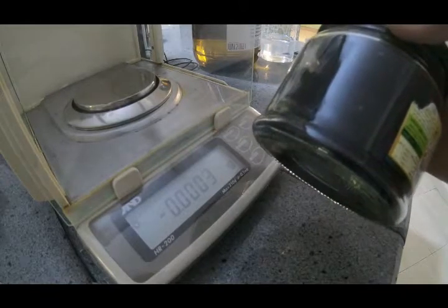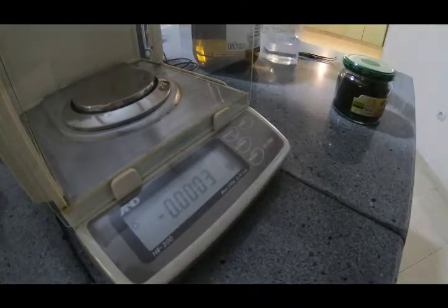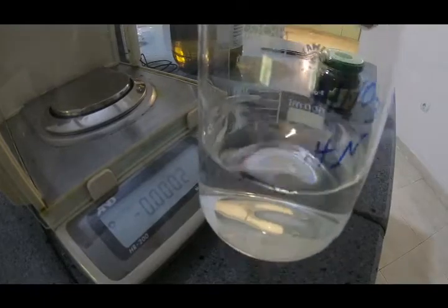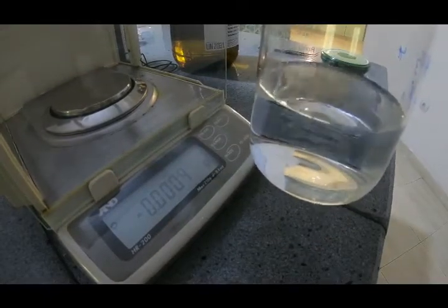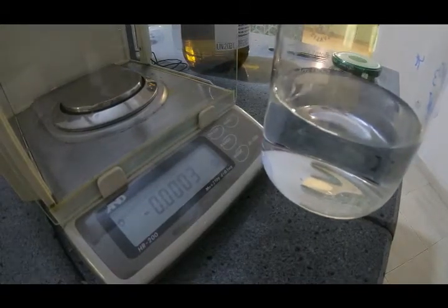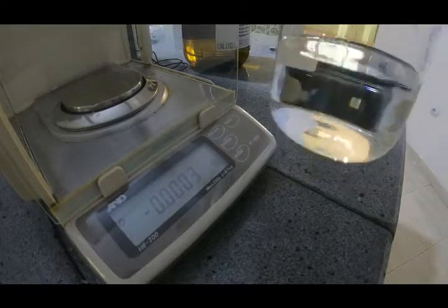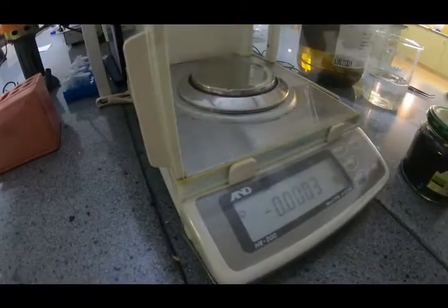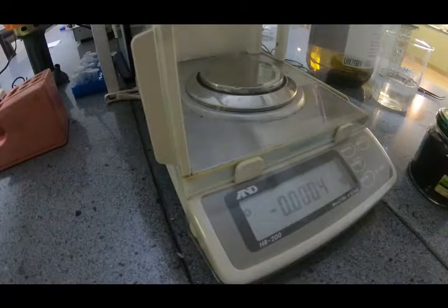I'm going to weigh about 10 grams of it and let it stir in nitric acid for about an hour or two. Then I will dry it by heating it, and then I can use it as the source of the carbon. So let's do it.